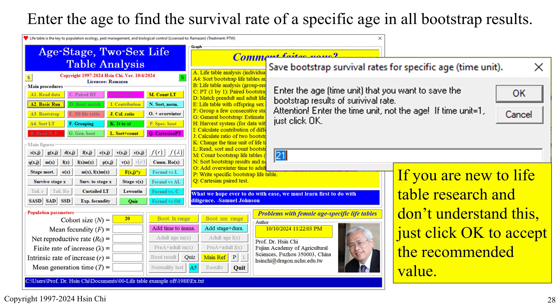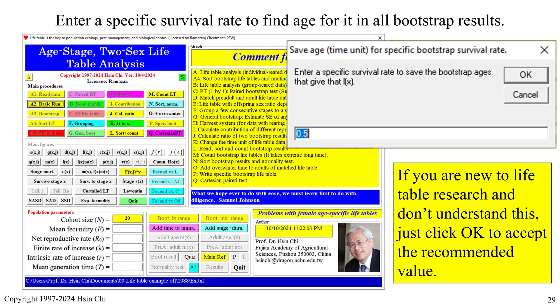When you see the message 'Save Bootstrap Survival Rates for a Specific Age,' you can enter the age to save the bootstrap result of the survival rate for all bootstrap results — useful to detect the standard error of the survival rate at a specific age. If you are new to life table research and don't understand this, just click OK to accept the recommended value.